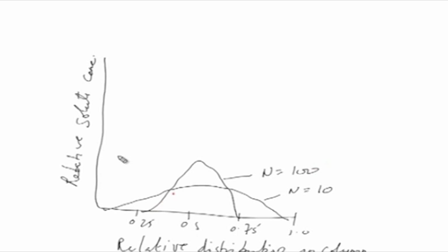So, you can see that as the number of theoretical plates increases, the base width decreases and the peak becomes sharper. Now, let us say there are 1000 theoretical plates, then the peak has become much sharper, and the base width decreases. Though the peak height goes up, the amount of solute, or the area under the peak, might remain the same, but it is now coming in a very small fraction.